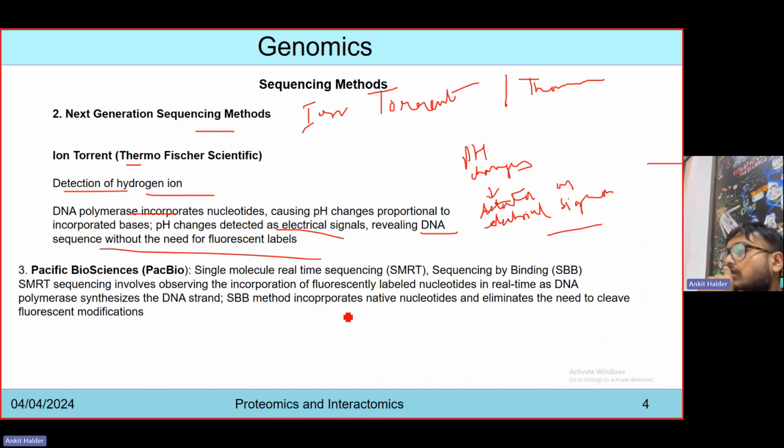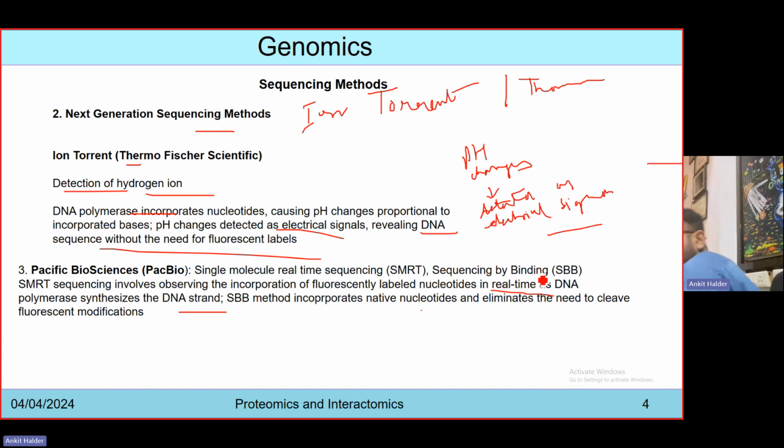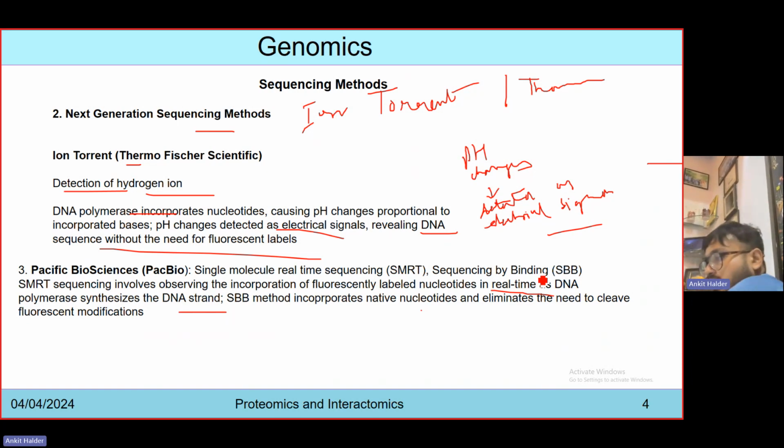It involves observing the incorporation of fluorescently labeled nucleotides in real time as DNA polymerase synthesizes the DNA strand.